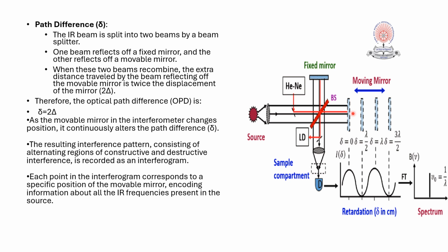And if the light strikes here at the last position as shown in this diagram, it travels longer still, and it returns that much. So here the path difference is still higher. Depending upon the value of the path difference, the interference may be constructive or destructive.